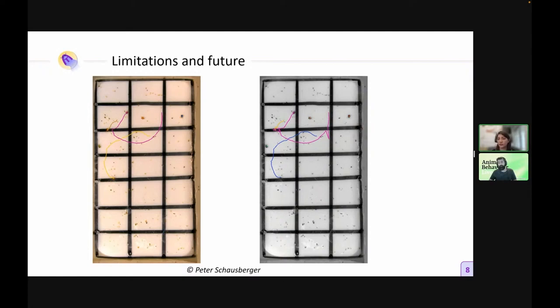The only thing you can do is to run this with the program and compare with what another program would have, a program that does not have the correction of the identity. So for instance, if we compare with idtracker, it is much better for that. It will follow the identity, but not ours. If you compare with T-Rex, you have the same. But if you compare with a program which does not have this correction, we are at the same level, more or less, of problems.